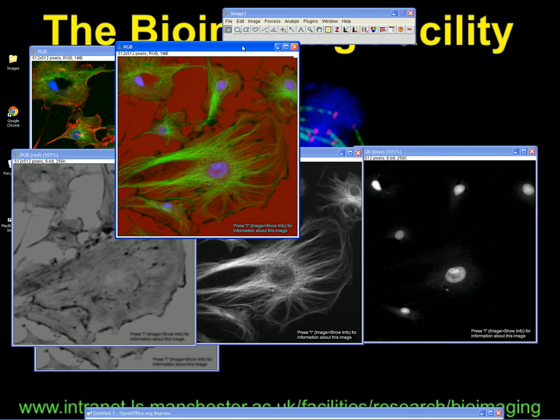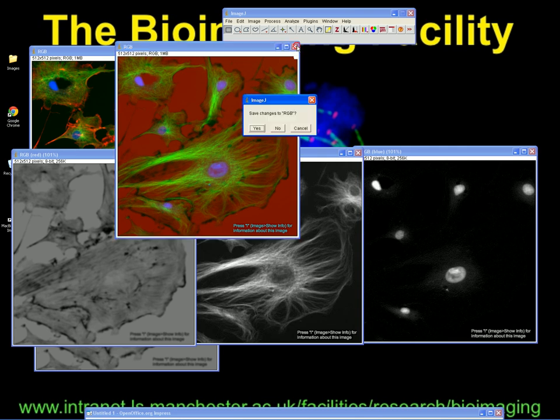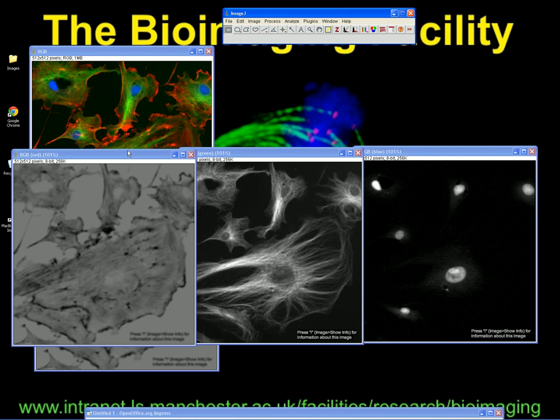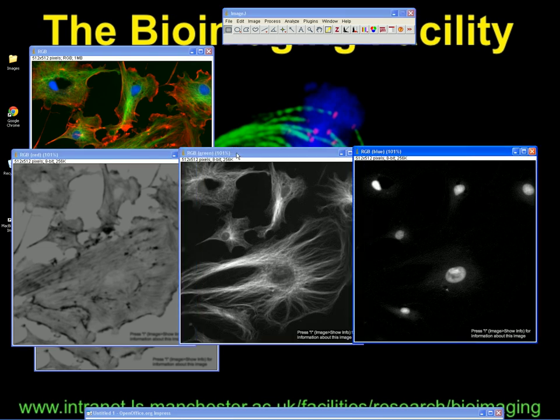It was just a way of storing those documents and moving them about from the snapshot microscopes onto the PC, knowing that those three images actually belong to the same set. What we really need is the individual channels as split components. We want to show the two fluorescence channels as a merged image, with the phase contrast superimposed on top.